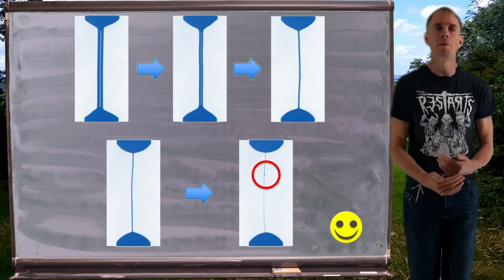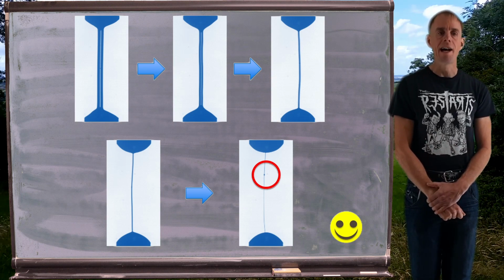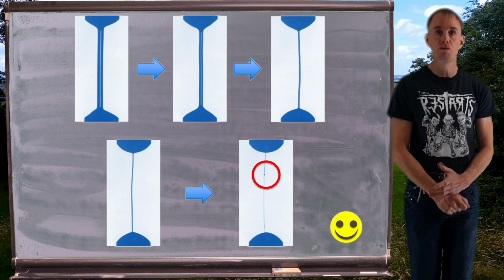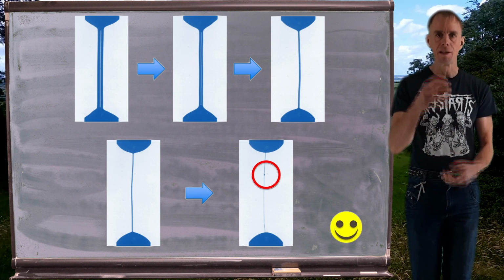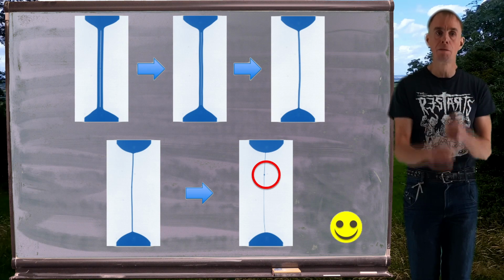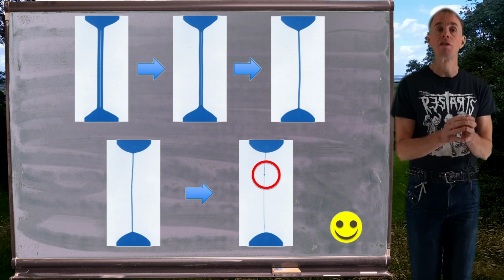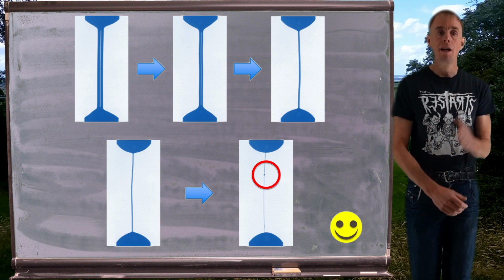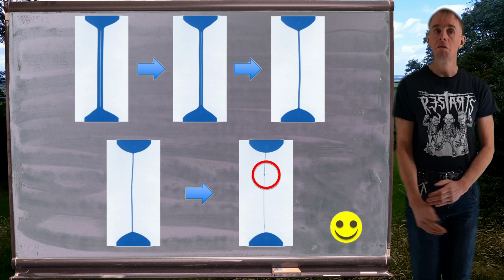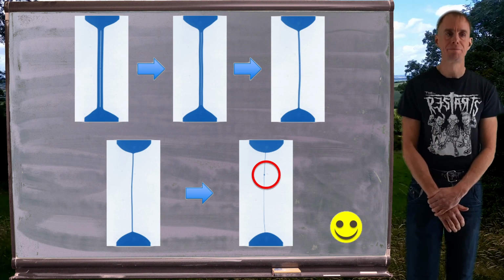Beading is a behaviour that we see very often with viscoelastic liquids, and one that usually disrupts the ability to take useful filament thinning data, because the dynamics of what's happening in the filament above and below the bead actually have changed from the dynamics that you'd see in just a purely cylindrical filament. But up until the onset of beading, this is a very nice experiment. We could get some good data from this.